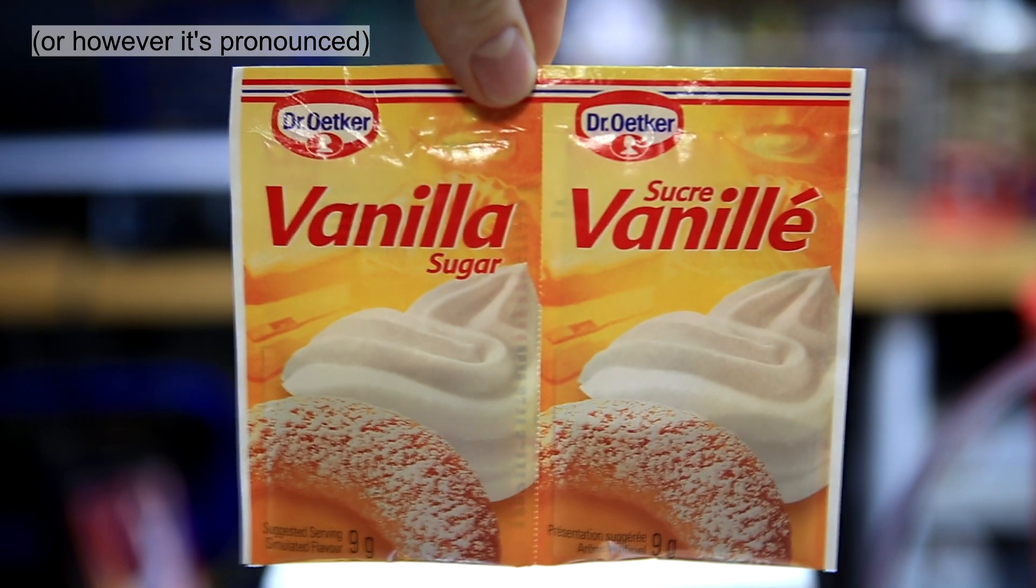For this experiment I used 18 nine-gram packets of vanilla sugar and 350 milliliters of methanol. I used Dr. Oetker vanilla sugar but you can use any kind as long as the only ingredients are artificial flavoring and sugar.